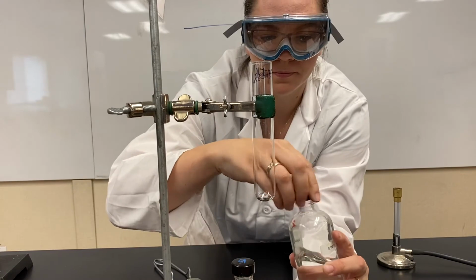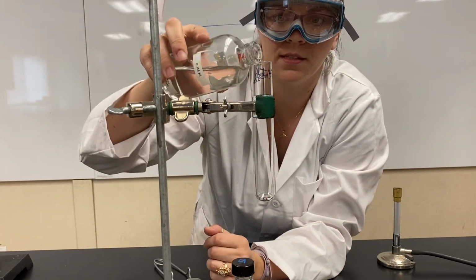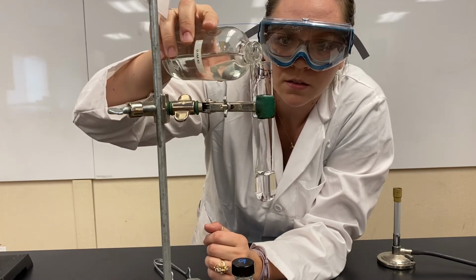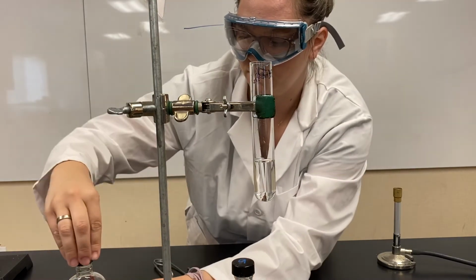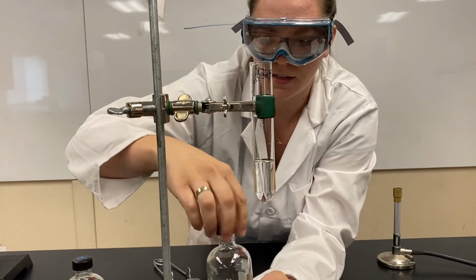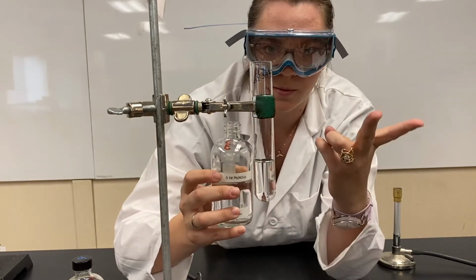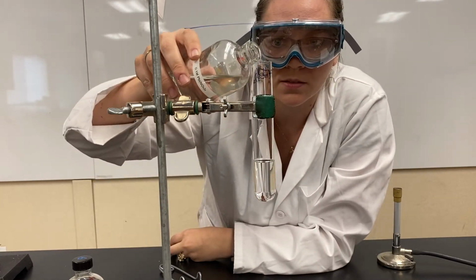So we have our potassium iodide that we're adding first. And we are going to add lead(II) nitrate to it. Okay, and this is like wife swap, right? The anions flip-flop. So let's see what happens.